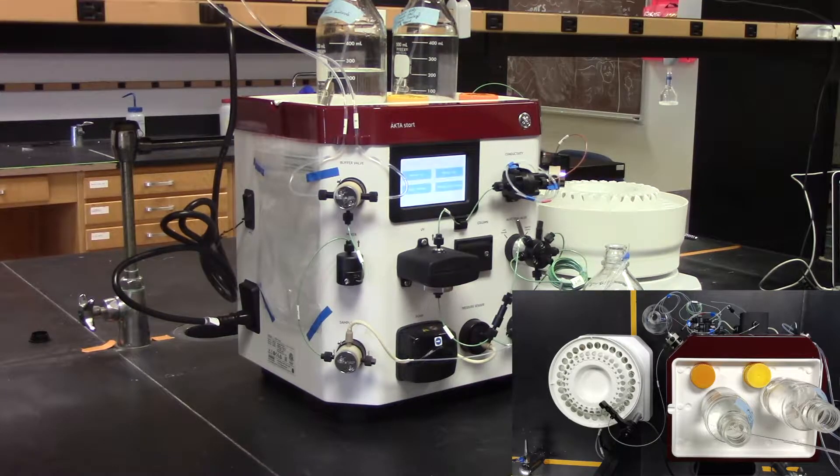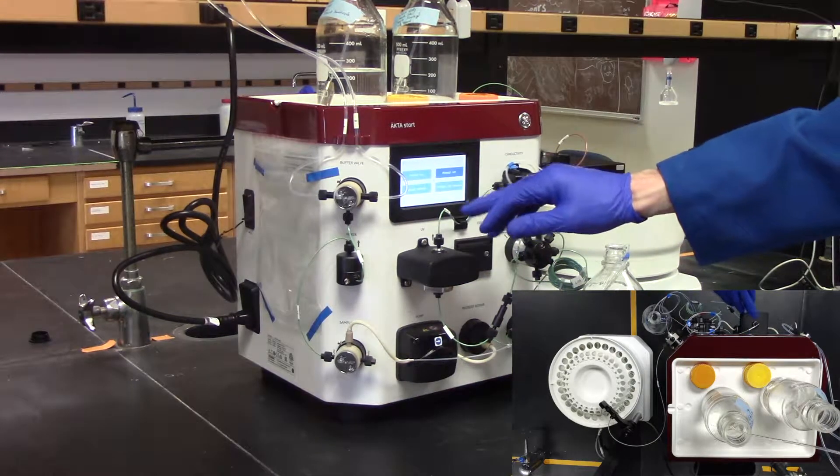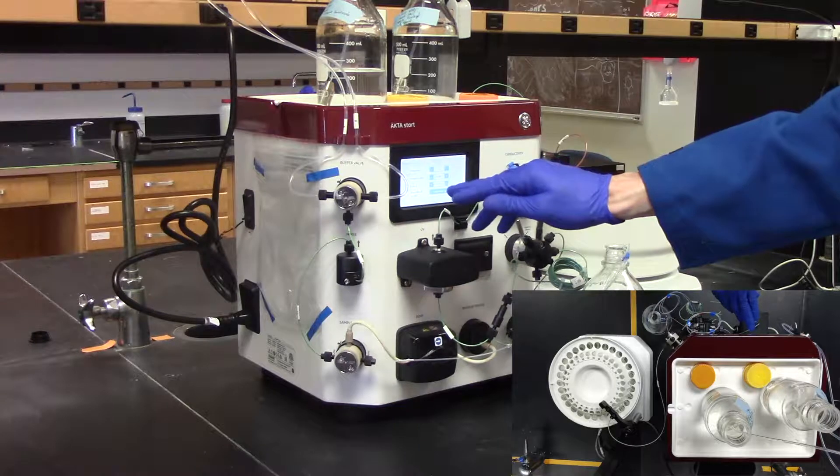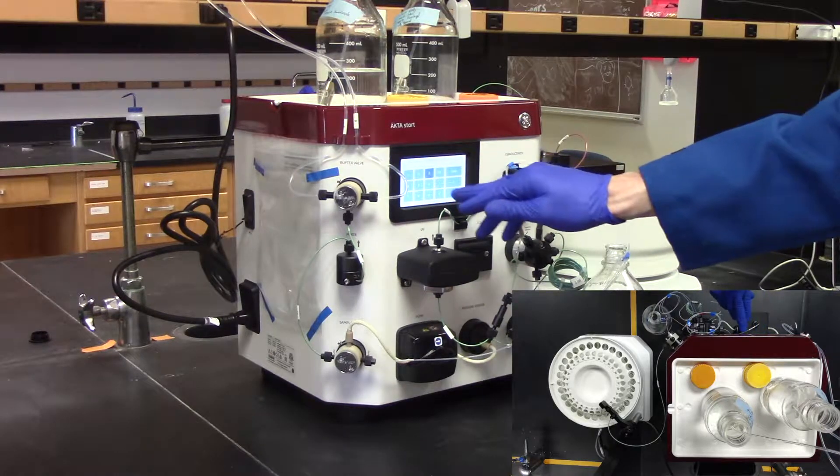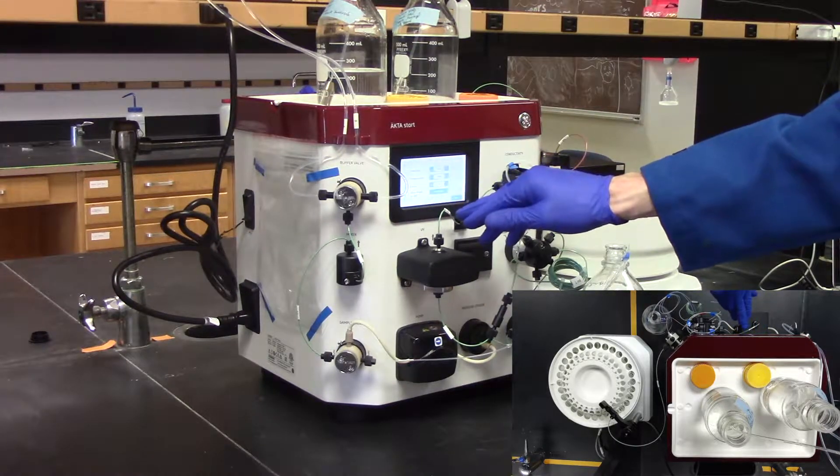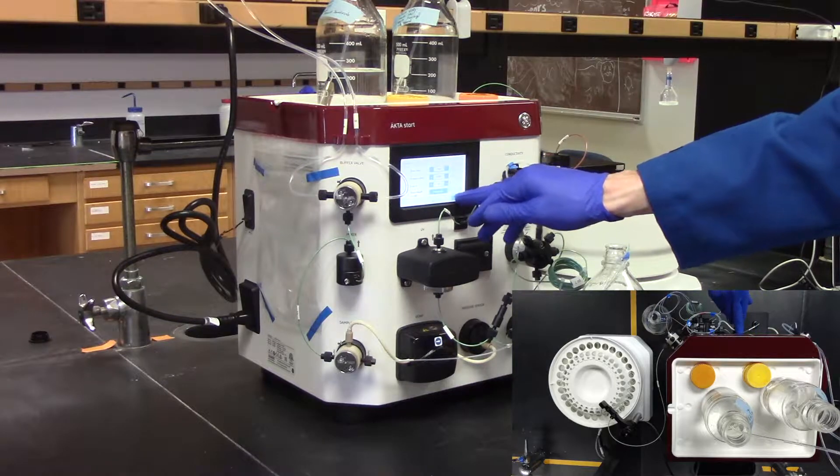Purge the A line by accessing the manual run screen and increasing the flow rate to 3 mls per minute. Be sure no air bubbles are in the line. To purge the B line, increase the concentration to 100%.